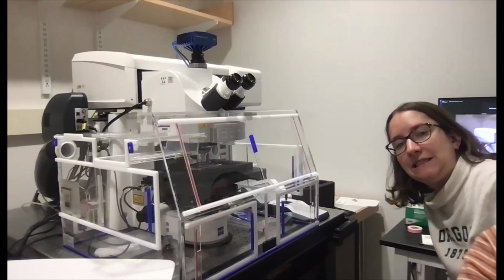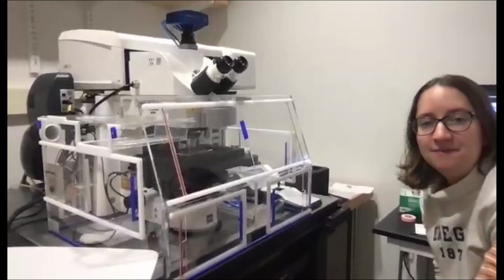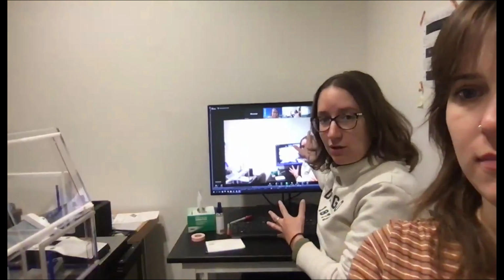How's that? Yeah, I got a couple wows in the classroom. Yeah, we're used to our compound microscopes and everything, but seeing something with all this glassware around it for sterility and everything, that's so cool.